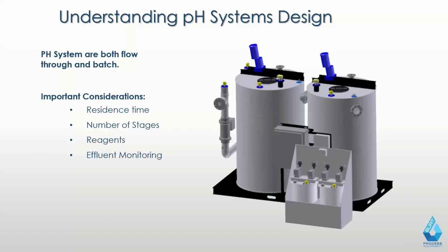Yeah, thank you, Madison. A lot of those are dependent on the person and the actual client in general. Obviously you need two reagent chemicals, whether it be sulfuric acid or sodium hydroxide, and there are pros and cons to both, and a lot of that comes down to chemical handling. As you pointed out here, these are double contained fixed tanks, which need to be filled either from a tote or a drum. The other option is to bring a drum up to it and have your draw lines for your chemical go into them.